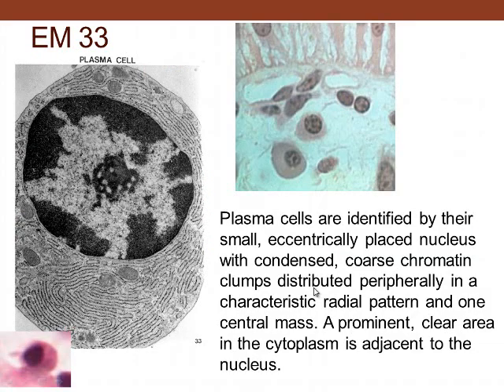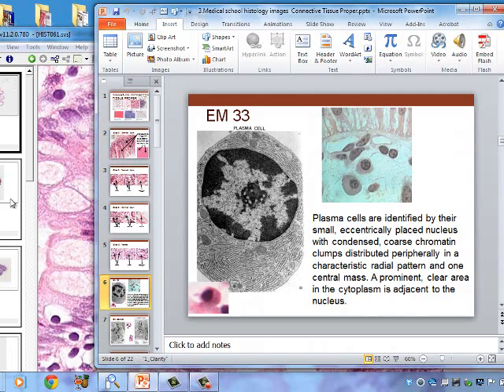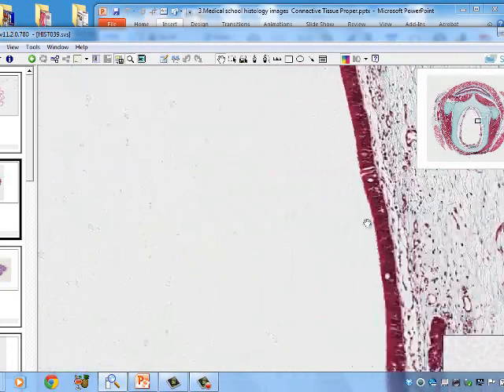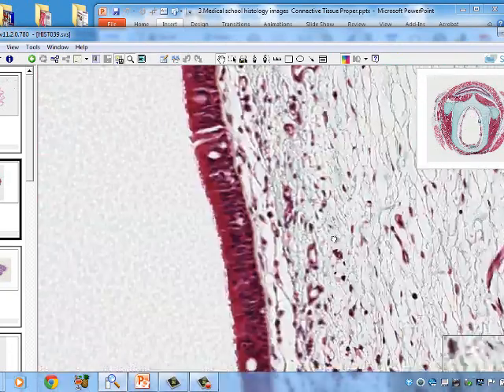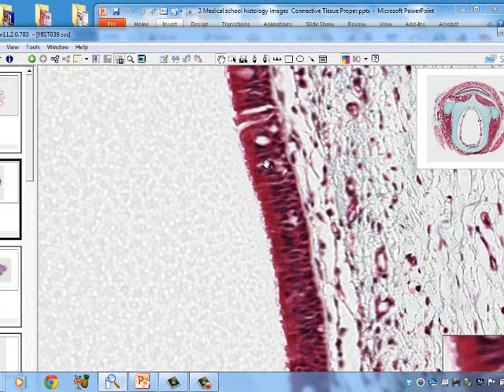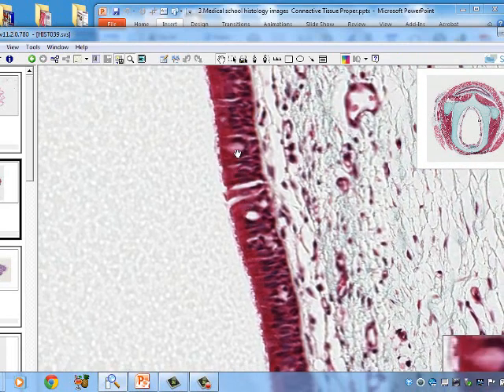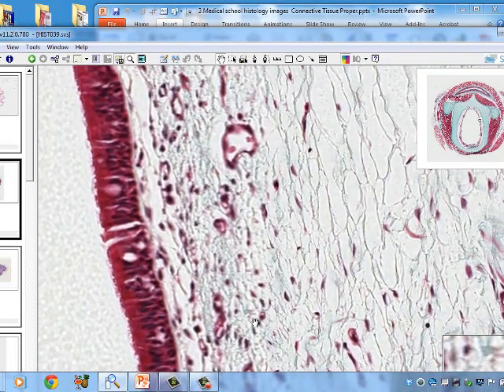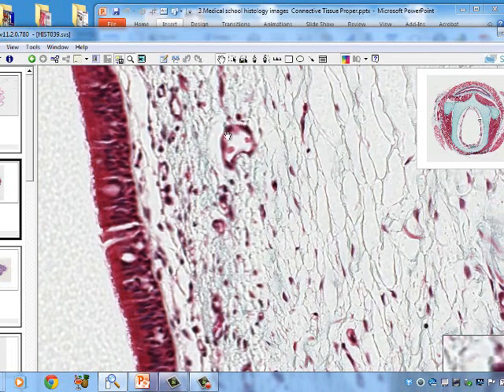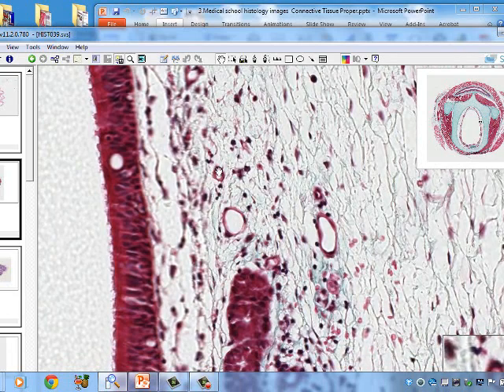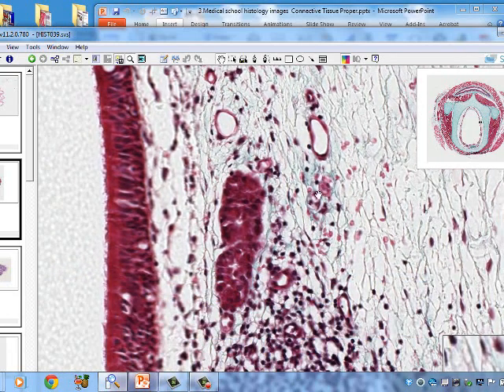We have another slide similar to slide 39. This connective tissue underlies respiratory epithelium, which is a pseudostratified columnar epithelium that is ciliated and has goblet cells. We see goblet cells, endothelial cells lining a small venule, and other endothelial cells nearby.